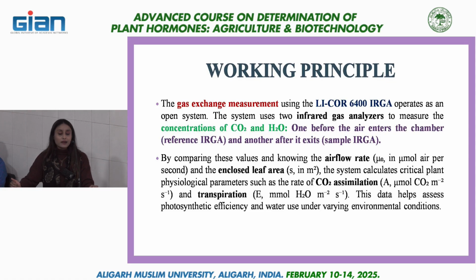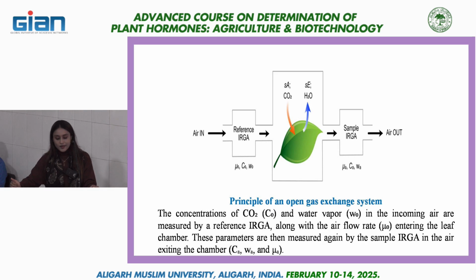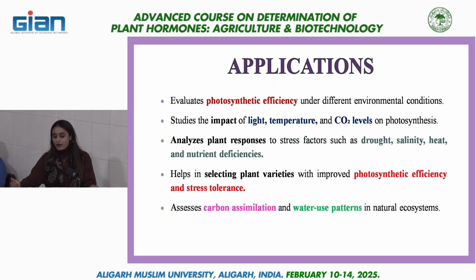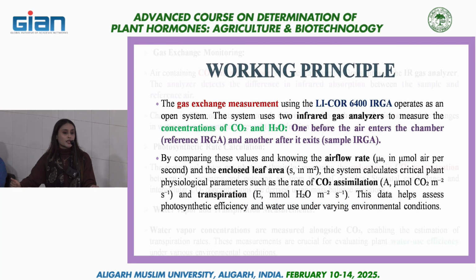Next is water vapor and transpiration measurement. Water vapor concentrations are measured alongside carbon dioxide, enabling the estimation of transpiration rates. These measurements are crucial for evaluating water use efficiency under various environmental conditions.